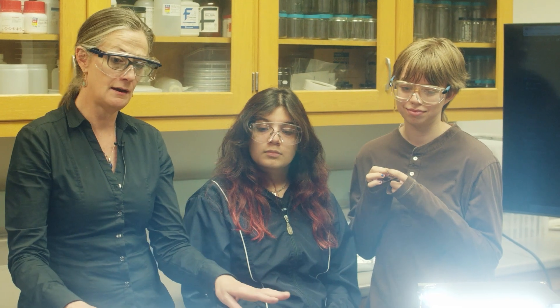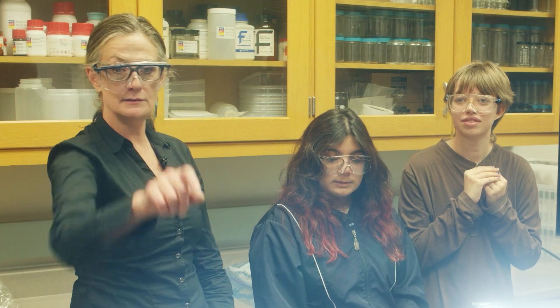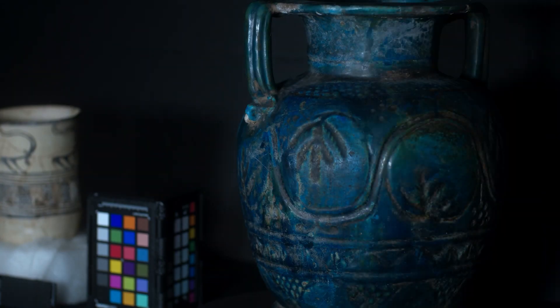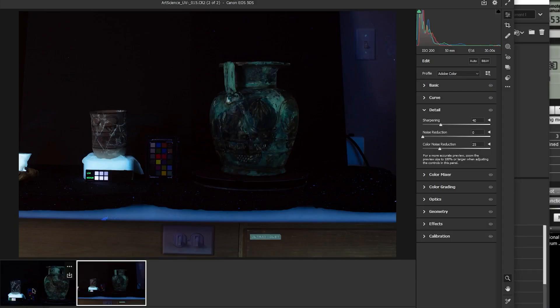Here we're set up with our normal illumination and we have our UV lights in those towers. I'm going to open the UV and shut off these, so we can open up the photo that we just took.